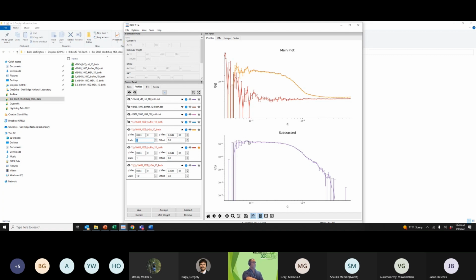Like I said, we have huge error bars here in this region because of the size of my protein, not giving a good scattering in this Q range. So for my low Q data, I definitely need to collect for much longer times to get good statistics at low Q. Maybe you don't need it. Here I used a long configuration to collect this data, but a short configuration of 7 meters, 6 angstroms could give me reasonably good data from this experiment.